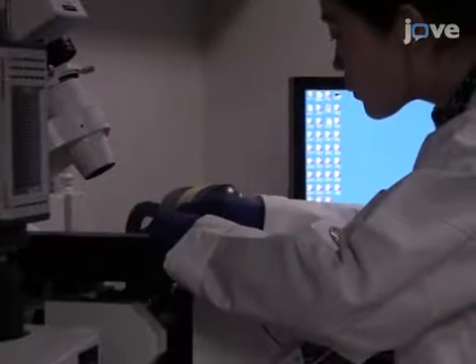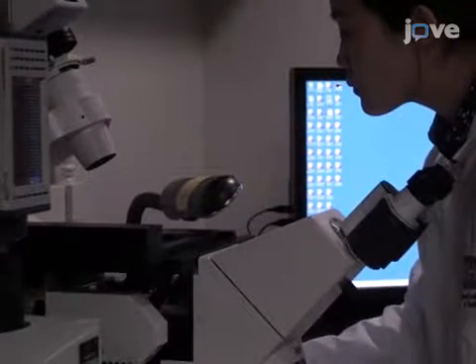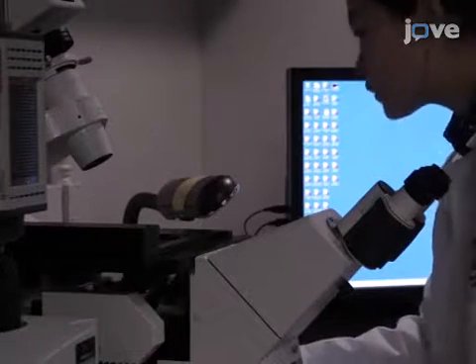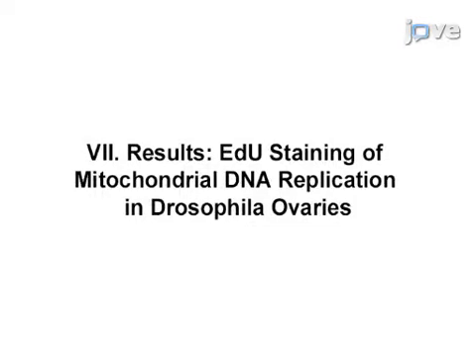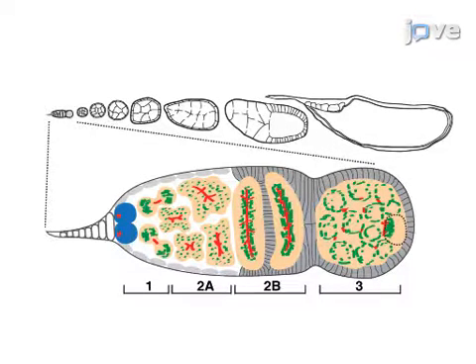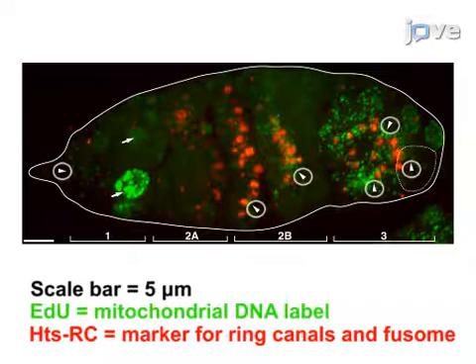Visualize the slides under a confocal microscope using a 63x oil immersion objective lens and capture three-dimensional Z-stack images of the ovarian tissue. The Drosophila ovariole is shown here displaying the typical successive developmental stages of egg chambers from anterior to posterior. Confocal images show EDU staining of the punctate structure associated with mitochondria, and EDU was confirmed to be incorporated into the mtDNA and nuclei during Drosophila oogenesis.